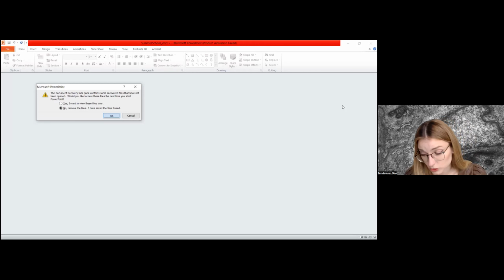Yes, electron microscopy is a very harmful method. So we have to follow all safety rules, because osmium tetraoxide is very harmful for our airway, and propylene oxide and resins are harmful, toxic and can be carcinogenic. But usually you work in the hood, in gloves, in a white coat, and it can prevent all side effects of this method.